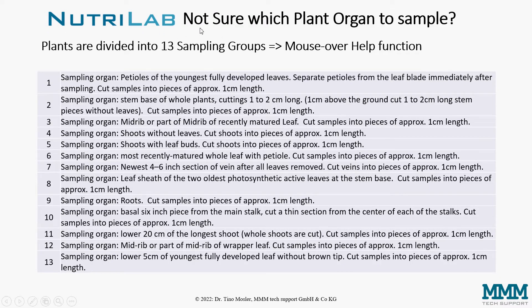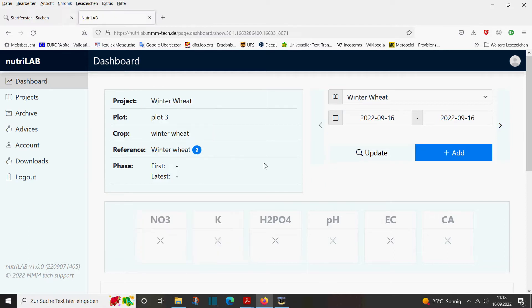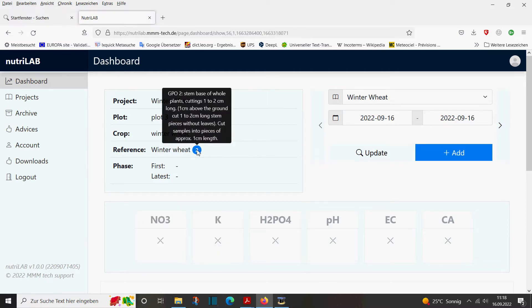In case you are not sure which is the best plant organ to sample, we have divided the plants into 13 sampling groups and there is a mouseover help function in our web app. Pepper, for instance, is in group one — there you need the petioles of the youngest fully developed leaves. Wheat, for instance, is in sample group number two. In wheat and other grains, you need whole plants, and what you use as sample organ is the stem base of the whole plant.